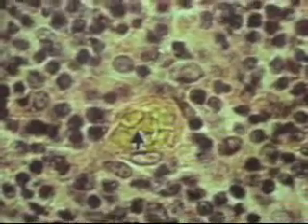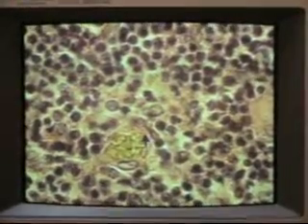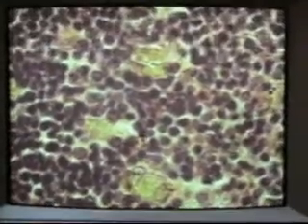So what I also can see here is a blood vessel. Okay, this is a blood vessel, and you see the red blood cells. They look somewhat greenish inside of it, and around it, these cells, if you look at them, these are the epithelial reticular cells which surround this blood vessel, and they form that barrier that we call the thymic blood barrier. And it's much harder to see in the rest of the tissue where there are much more lymphocytes. I'm trying to move out towards the cortex, and we are in the cortex.